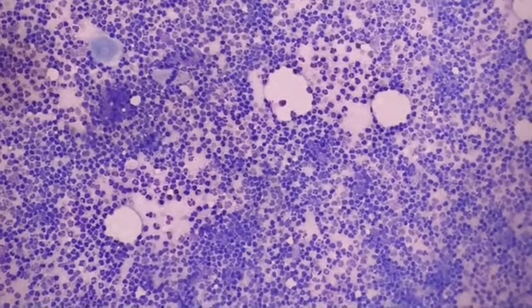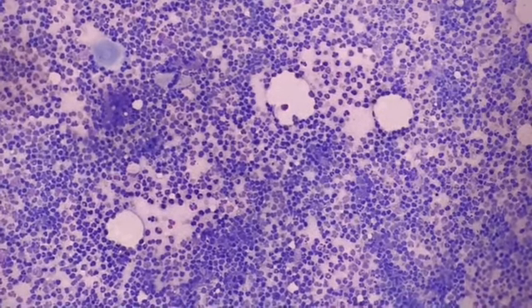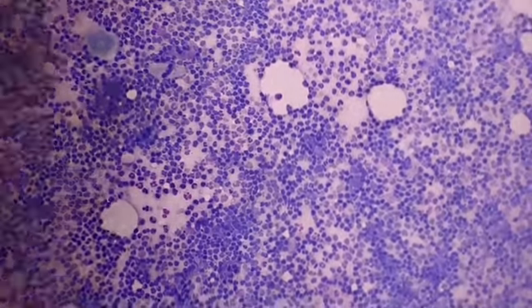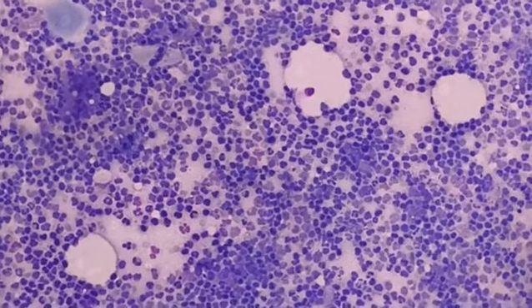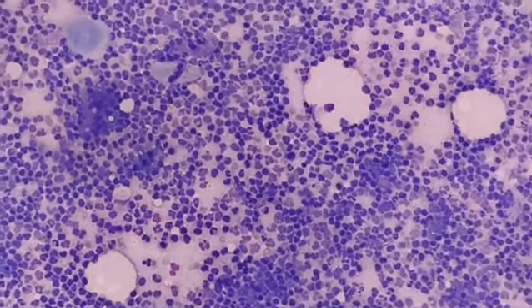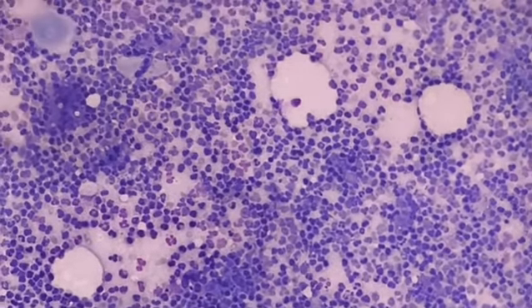On cytology, you can just put the impression as: cytological diagnosis is suggestive of a subareolar breast abscess, mention the left or right side breast, and then put a note. However, with a few degenerated cells and no well-defined ductal cells, we cannot rule out inflammatory carcinoma breast. For that, we need proper histological correlation along with clinical and radiological correlation. That is the differential.